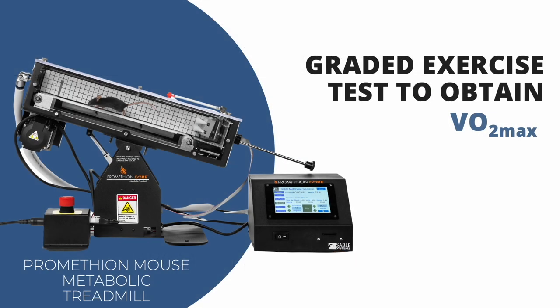Welcome to our exploration of graded exercise tests and the pivotal role they play in understanding cardiovascular fitness and exercise physiology. In addition to detailing different graded exercise tests, this video will describe how to perform a graded exercise test on research mice using a metabolic treadmill coupled to an indirect calorimeter, the goal of which is to determine the mouse's VO2 max. We will show one protocol, but of course there are many different test protocols depending on the particulars of the mouse model and research aims.